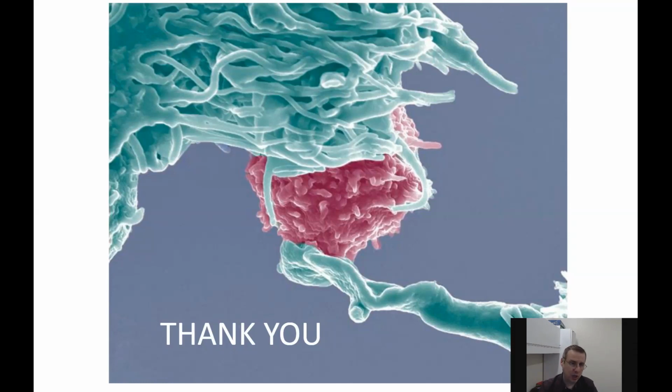That's why I believe that possibly a panel. It's not just one specific biomarker that's going to be the magic bullet. Right. And this idea of multiplexing, right? The prior work done by singleplex ELISAs naturally limits how many markers you can look at the same time, whereas with the scalable technology, we're able to actually look at multiple markers.